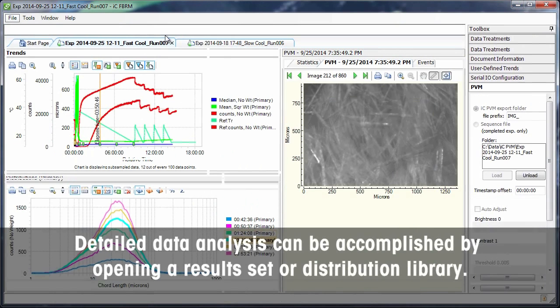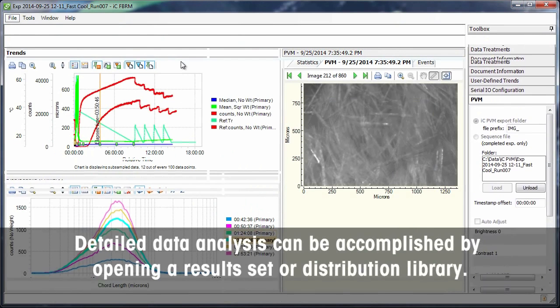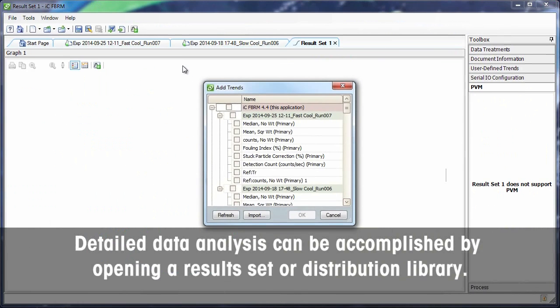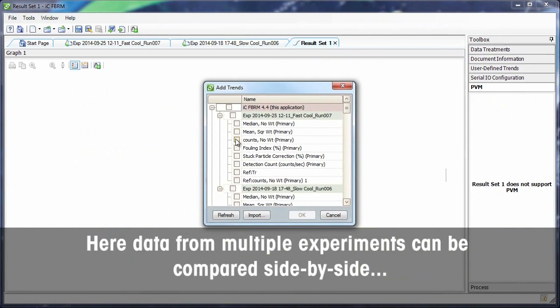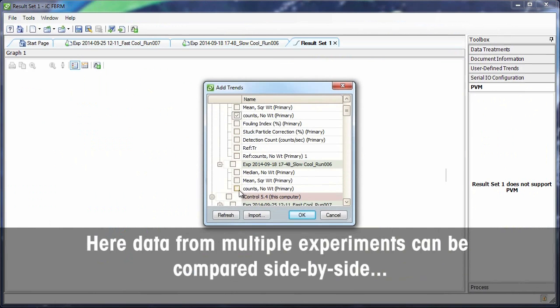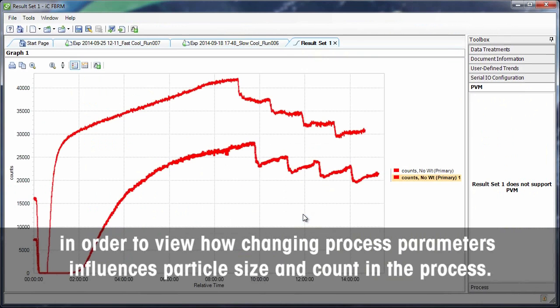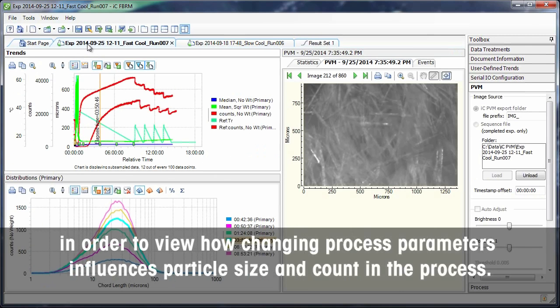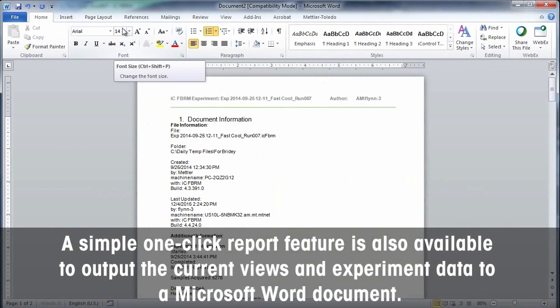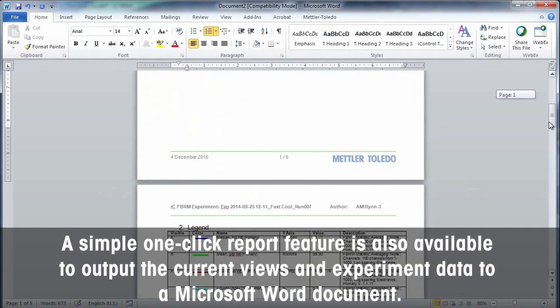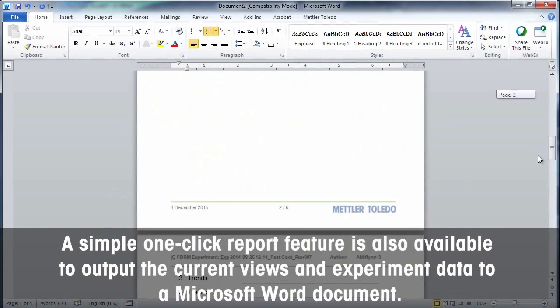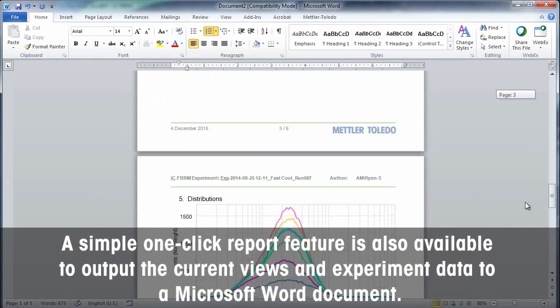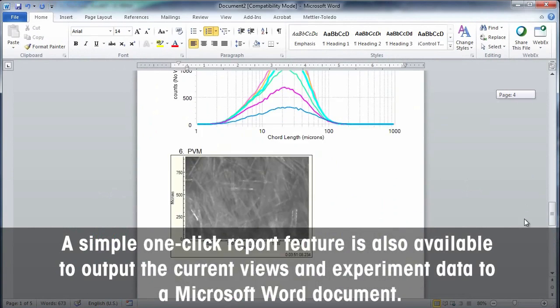Detailed data analysis can be accomplished by opening a result set or distribution library. Here, data from multiple experiments can be compared side by side in order to show how changing process parameters influence particle size and count in the process. A simple one-click report feature is also available to output the current views and experiment data to a Microsoft Word document.